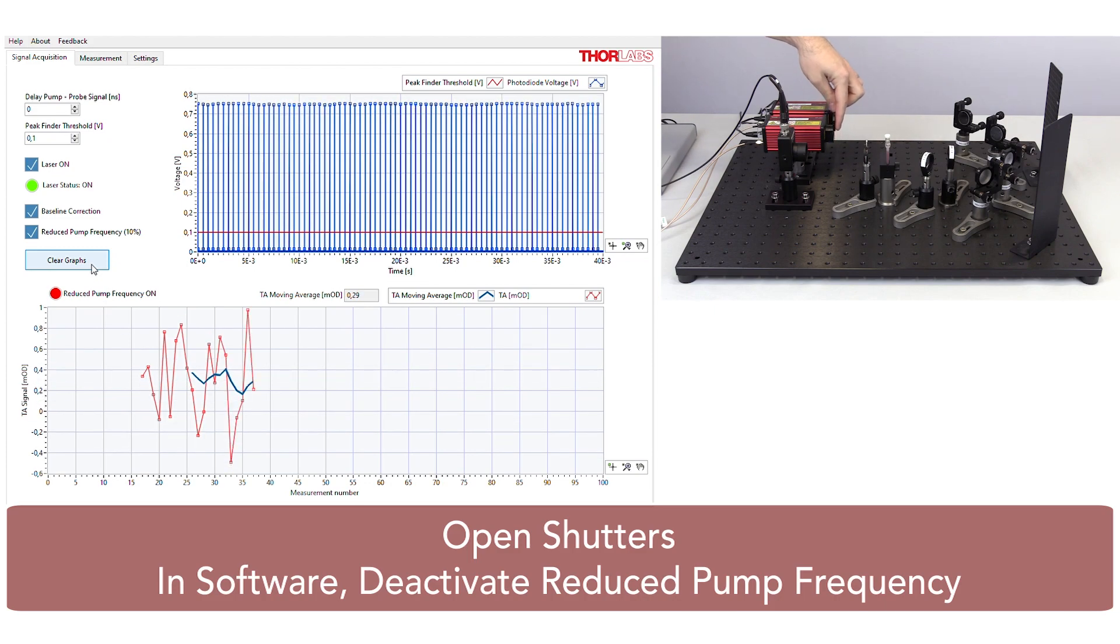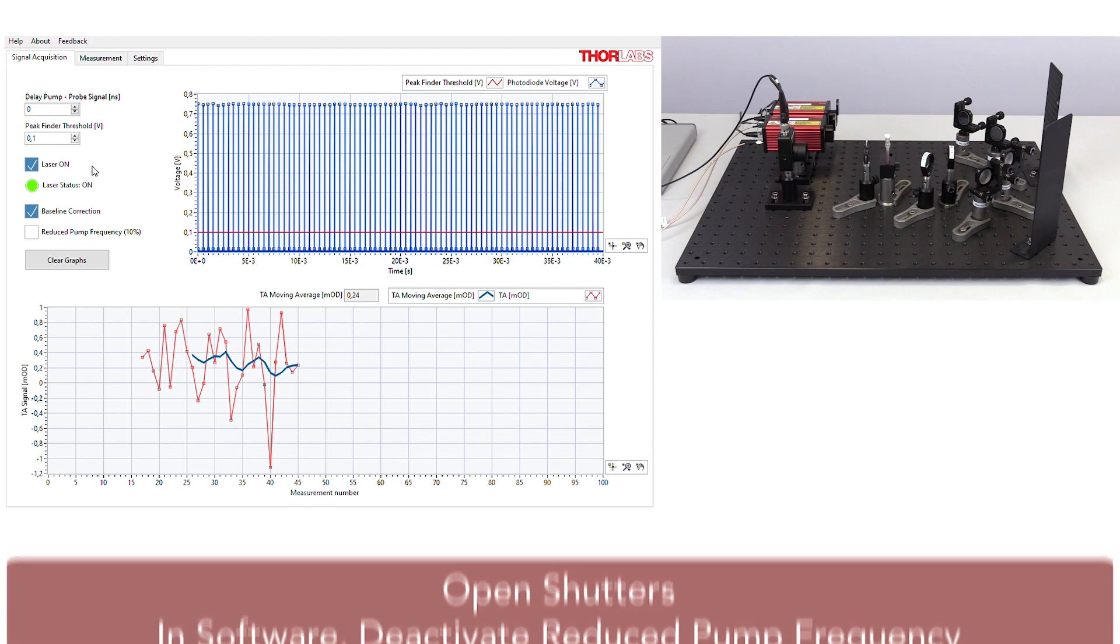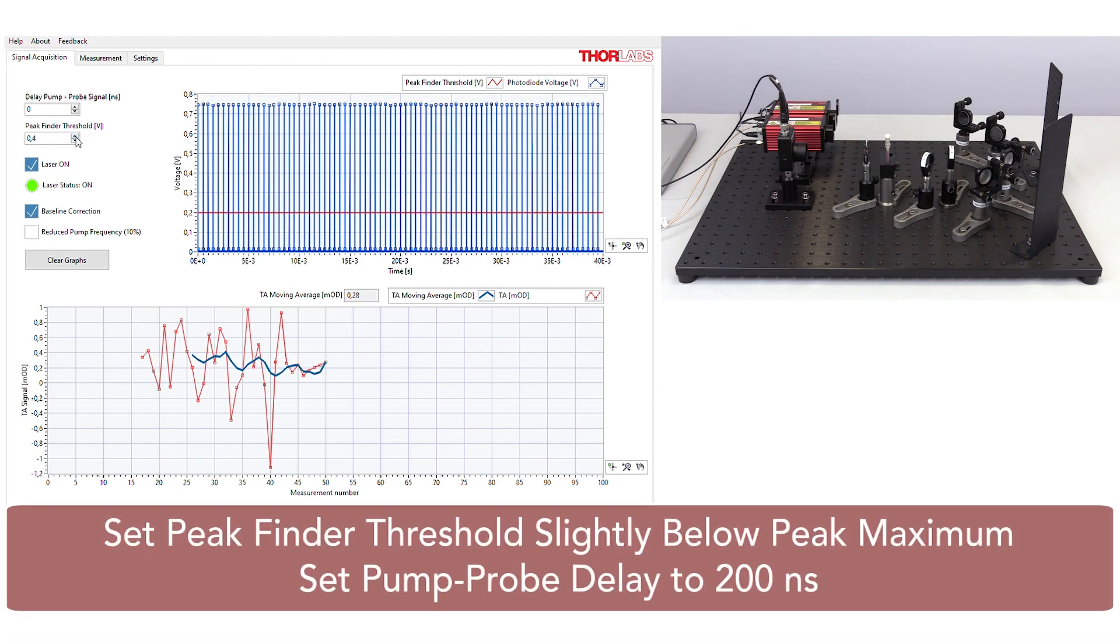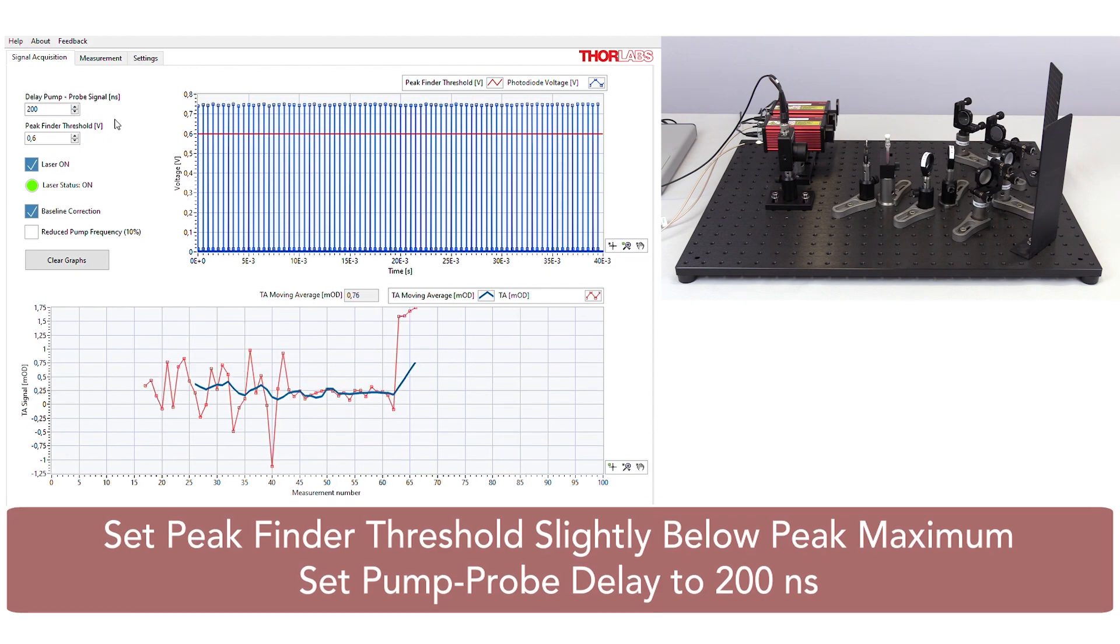In the software, deactivate the reduced pump frequency setting. Set the peak finder threshold slightly below the maximum peak value and set the pump probe delay to 200 ns.